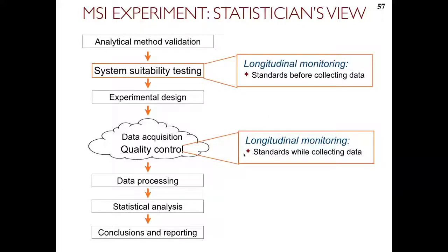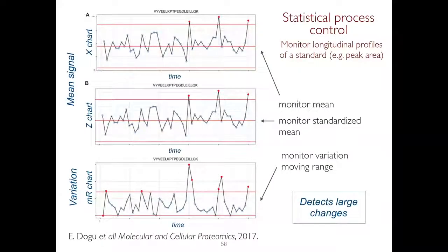And then also quality control. These are the standards that you profile more frequently to ensure that when you collect the data, the system performs as expected. So there are a lot of fairly standard tools for that. Traditionally in statistical literature, people use control charts.